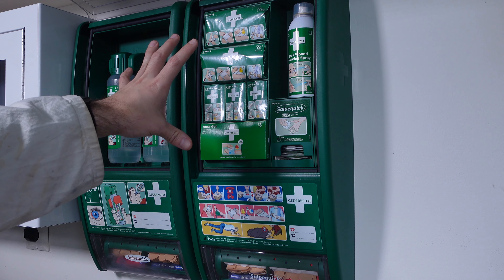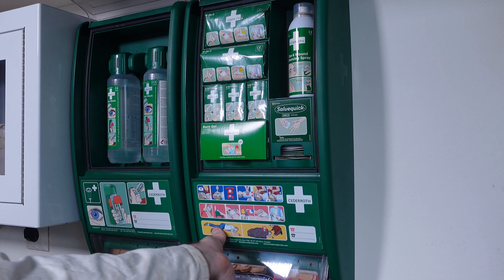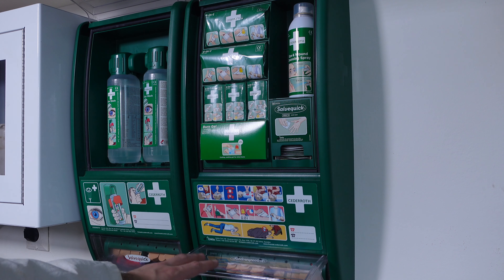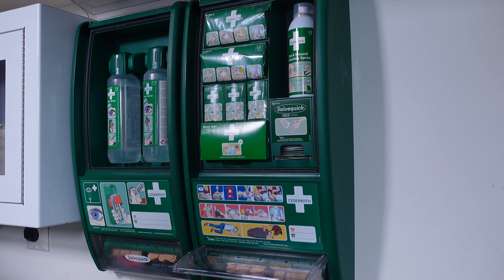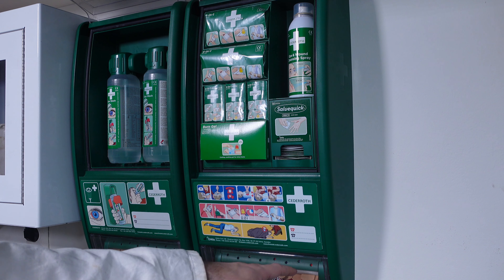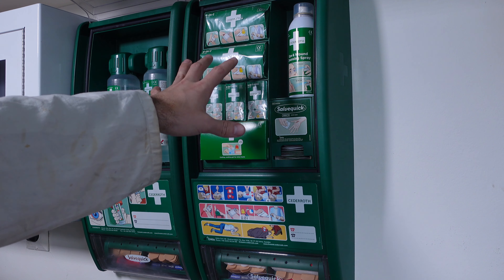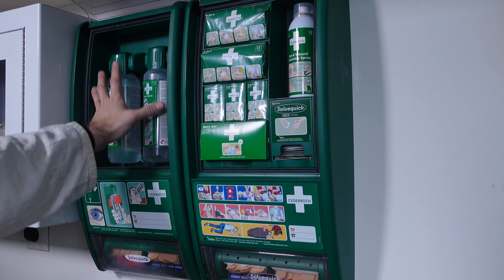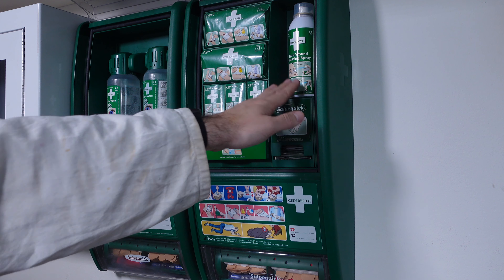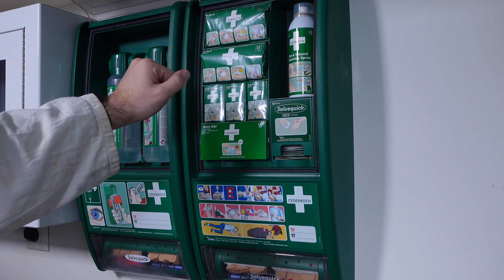On the bottom we've got a band-aid dispenser, and you can pull them down and easily attach one. You make a quick peek and you know exactly which item to choose from. Those two bays are designed to take care of your eye if you've got a contamination.